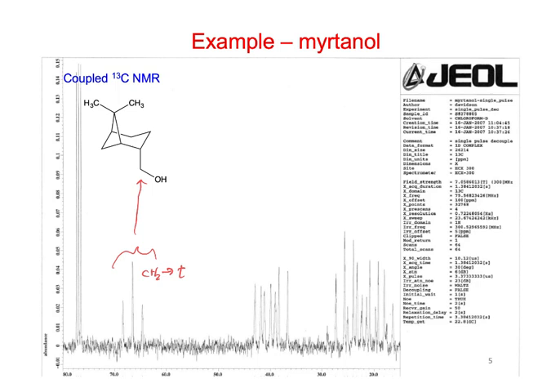In this next section, remember, I think this is the quaternary one. And this is a doublet. And I think it probably goes like this is a doublet and maybe this is a doublet.